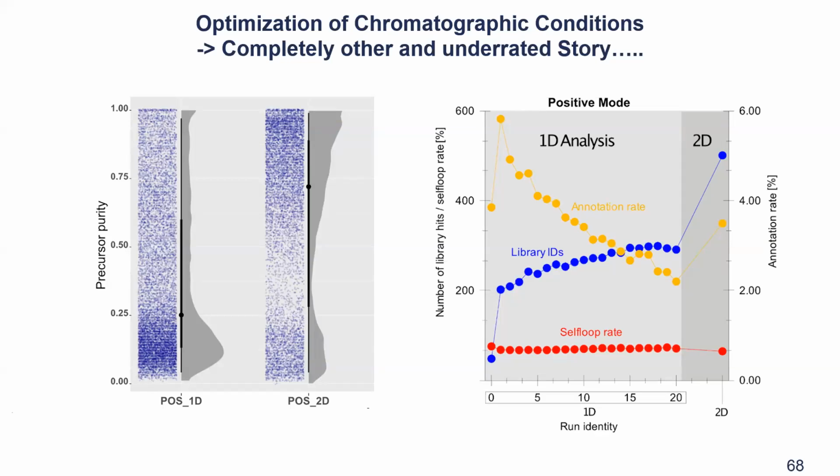And then one thing that I just want to mention, which is often forgotten, is that it's not just the mass spectrometry.